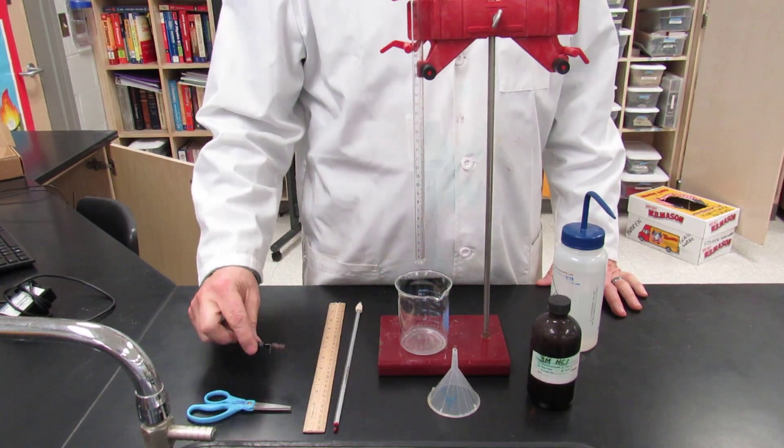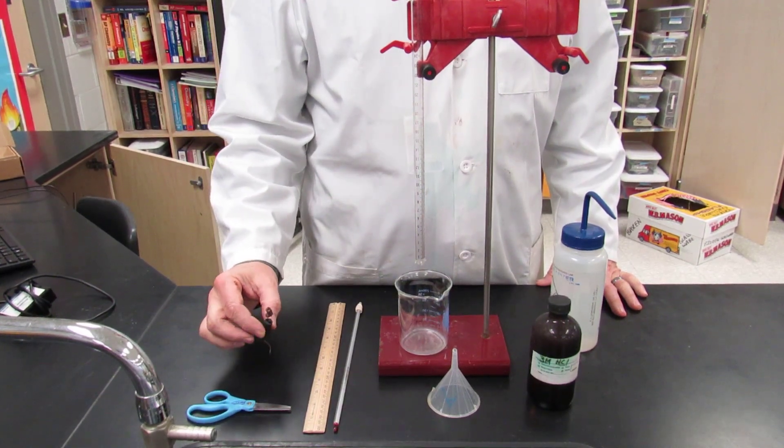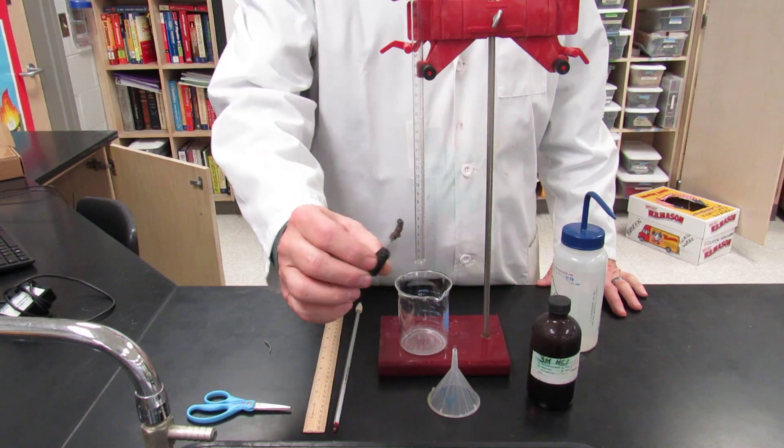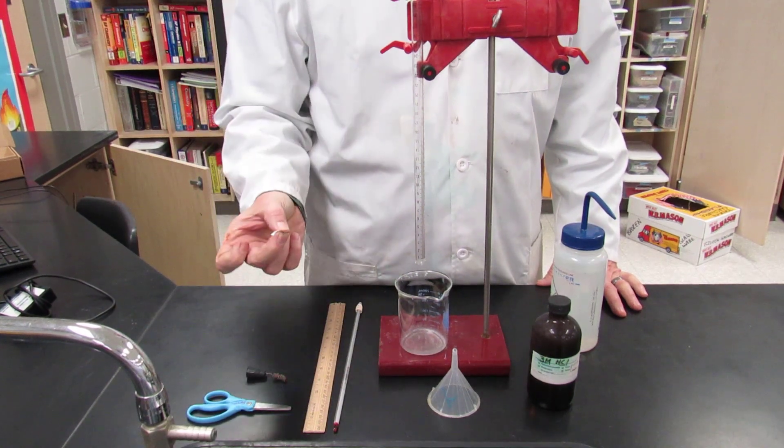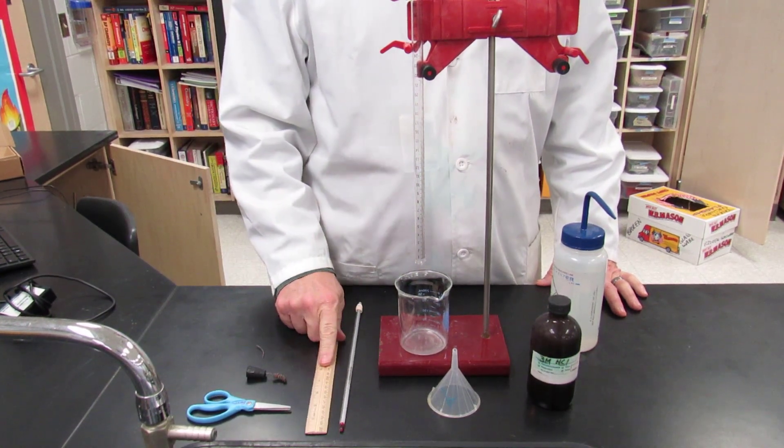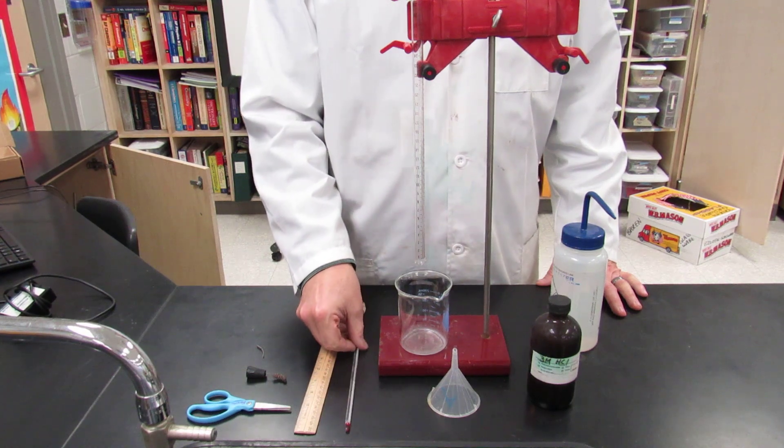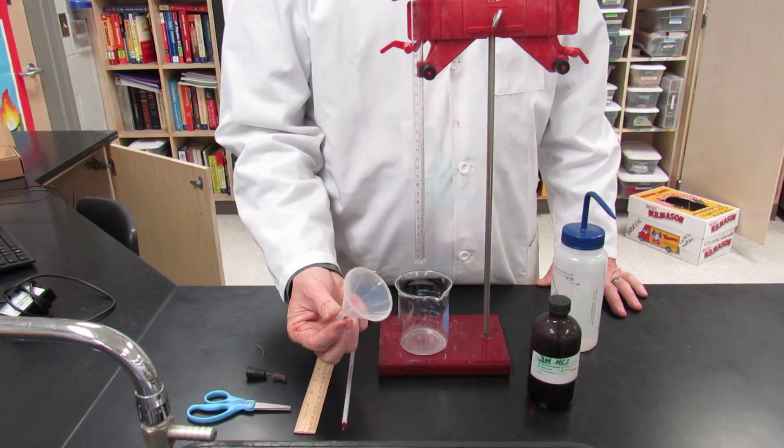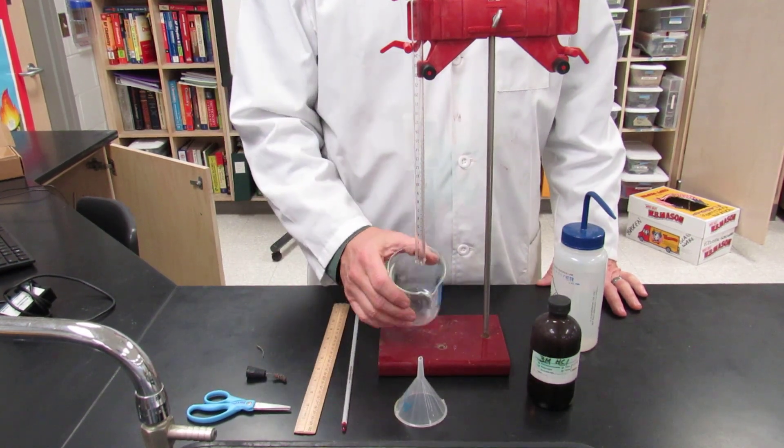Okay, first thing you need is a pair of scissors, a stopper with a coiled piece of copper in it coiled up into like a little spring, a piece of magnesium, a ruler, a thermometer, a plastic funnel, and a small beaker.